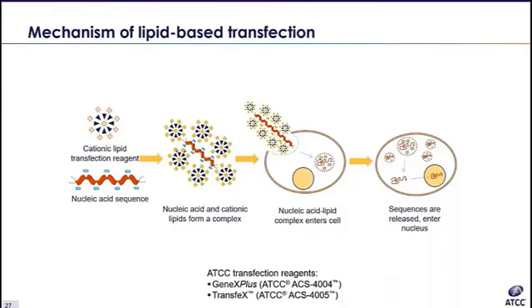It's based upon the idea that opposites attract. The transfection reagent is a cationic lipid that forms micelles with a net positive charge. Nucleic acids have a net negative charge, allowing the formation of complexes of lipid and DNA. The nucleic acid is covered by the micelle, so the complex now has a net positive charge on the outside.